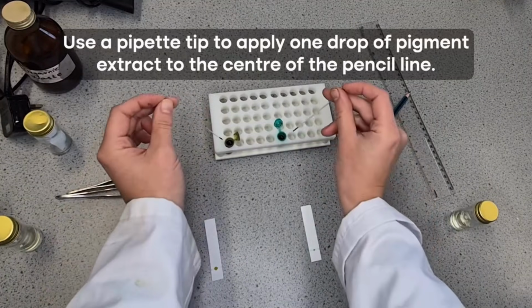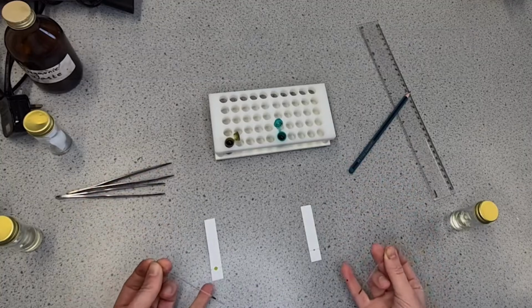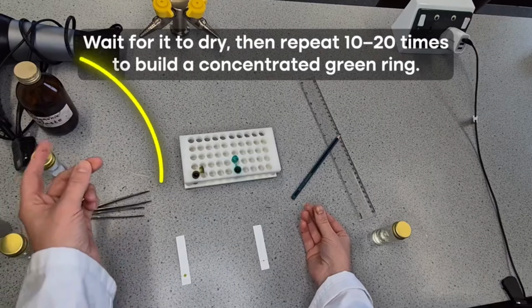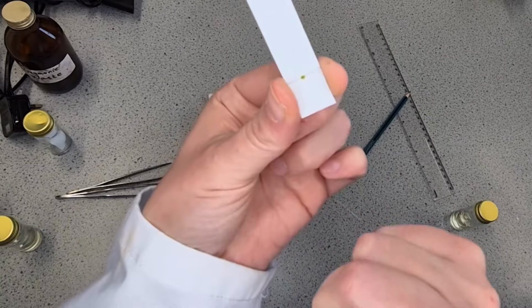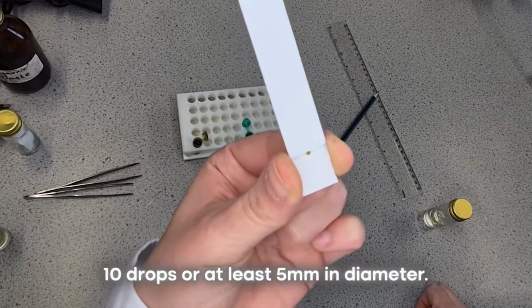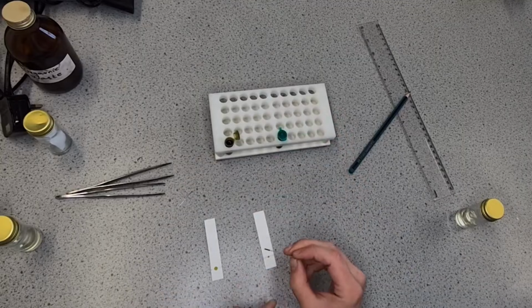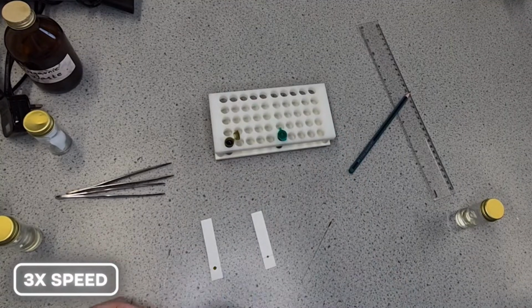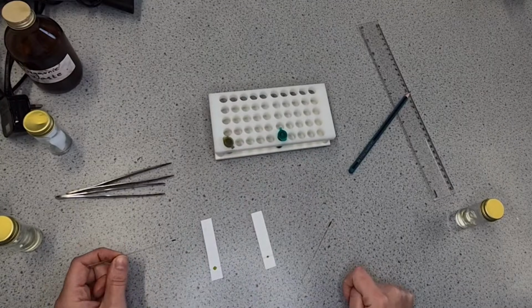So they just need to dip it in, keep your fingers over the top to create a bit of suction, dip it on the paper, but you need to wait until it is dry before you then add the next drop, which is why I've got the hairdryer here, so you can see when it is dry. And we'll keep going until we've done 10 drops, or at least 5 millimeters in diameter. They probably won't need to dip it again, this one. And wherever possible, close the lids, because otherwise that's going to let out the solvent.